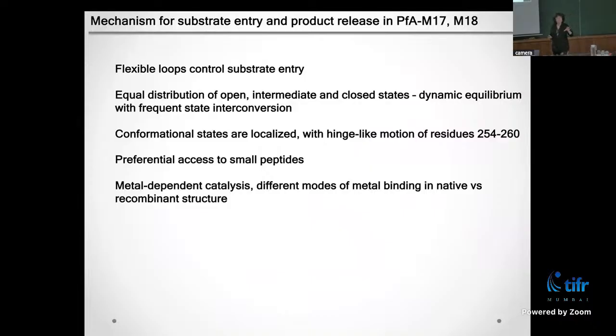But yeah, that's a good point, that the resolution is not really down to a very high point, but we are not expecting that, because it's very hard to reach there from this data. Refinement. Certainly, yeah, certainly it's feasible. Okay, so this is again with M18, we are getting more information from the native structure.